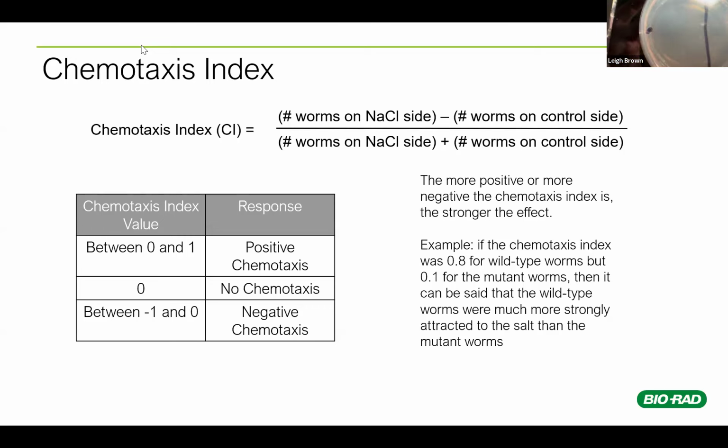So it's really hard to see right here. Let me see if I can see the worm. Sometimes it helps to look at the worm trails too. You can kind of see they leave this little trail, it's going to be hard to show in the video. Yeah. If you tilt it towards the light, you can kind of see where they've been crawling around. They leave a little trail, almost like a snail trail, right? And so you can kind of see where the trails are on one side or the other.